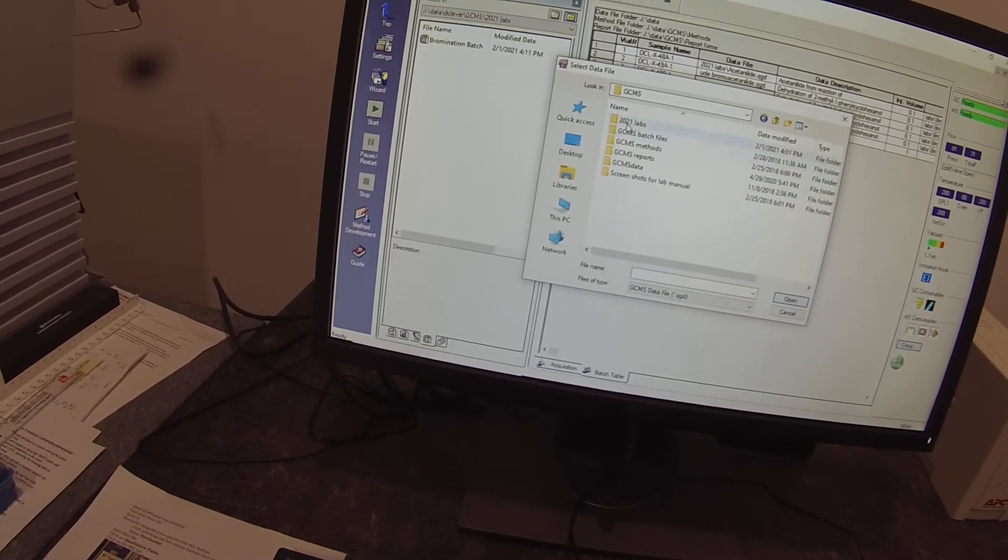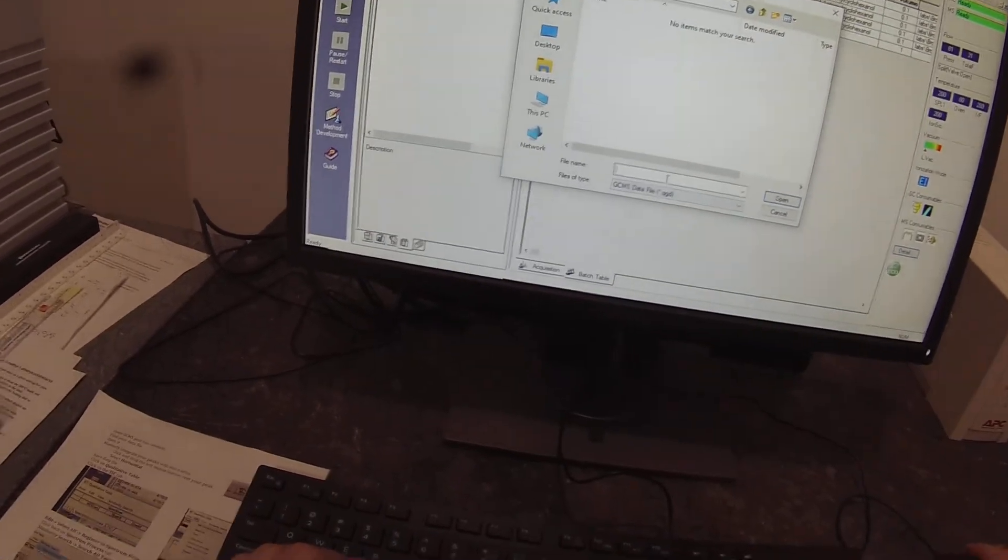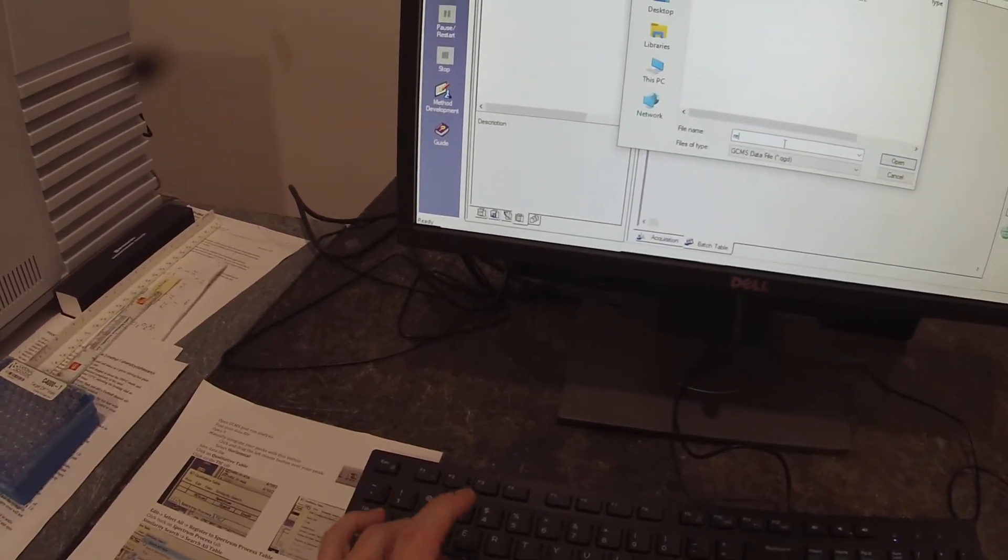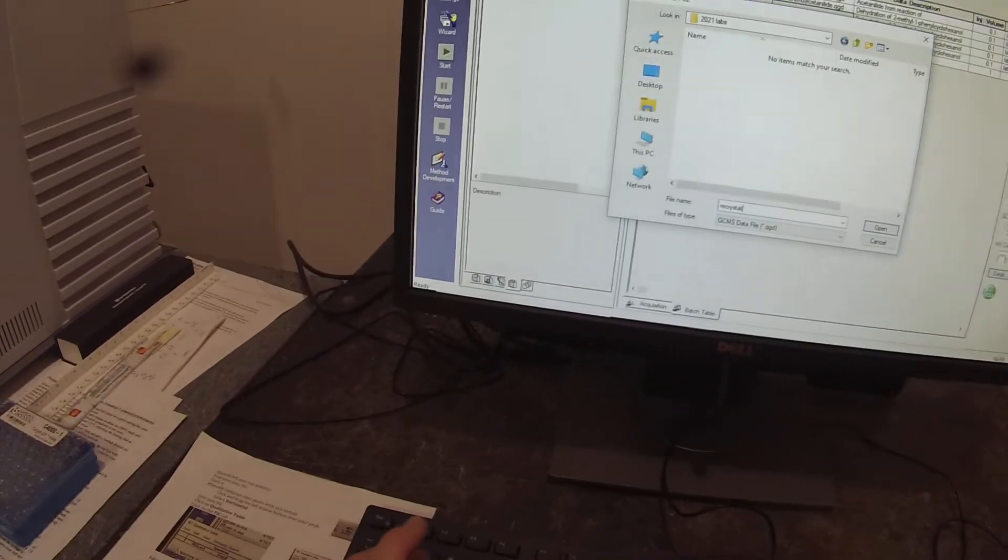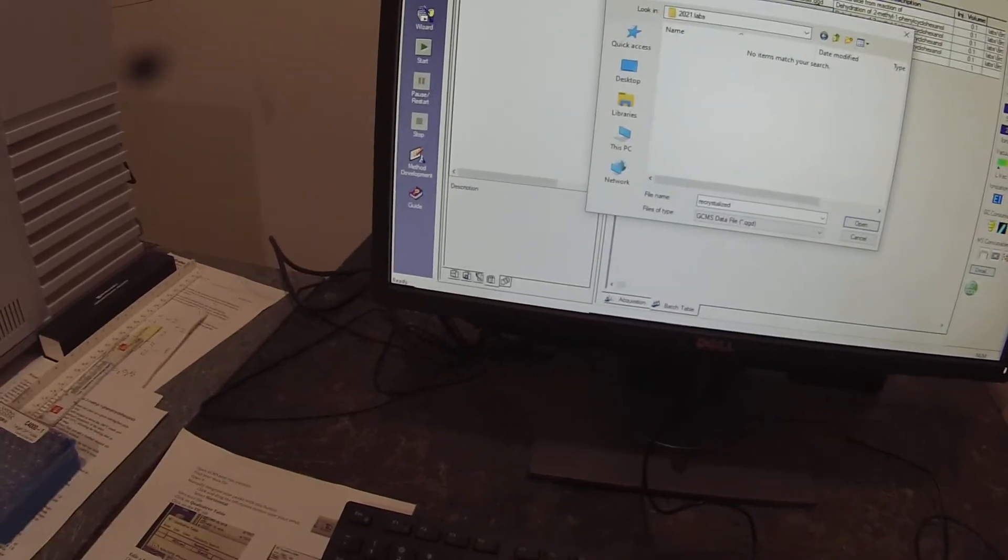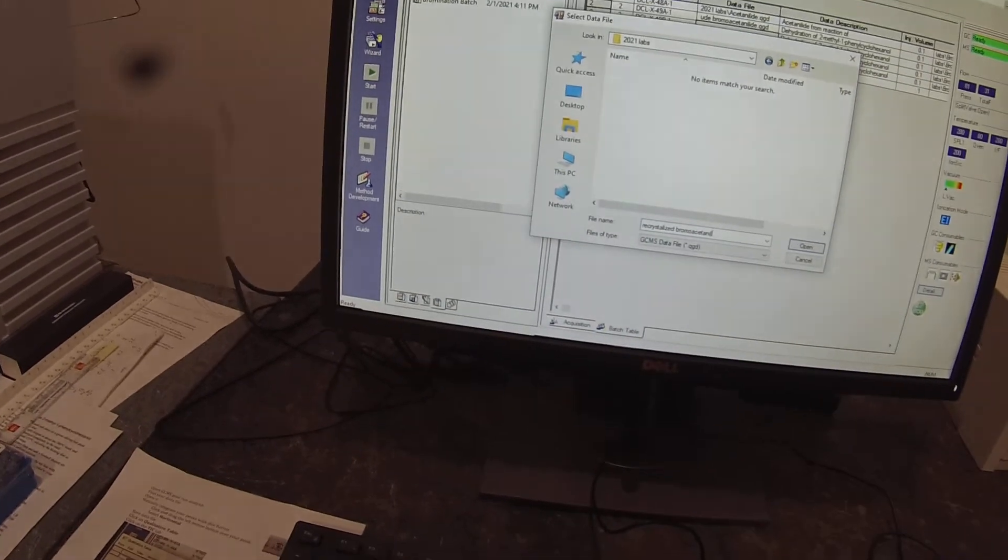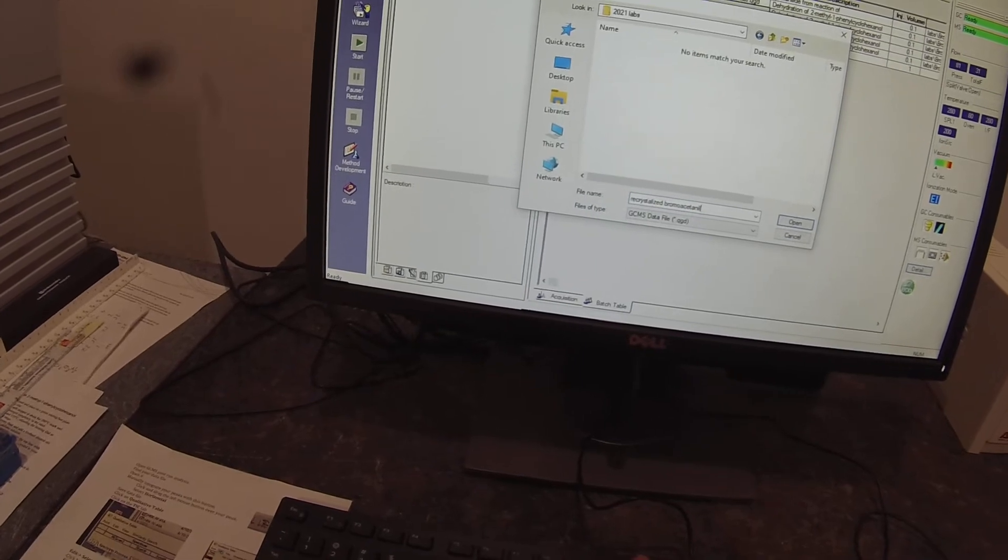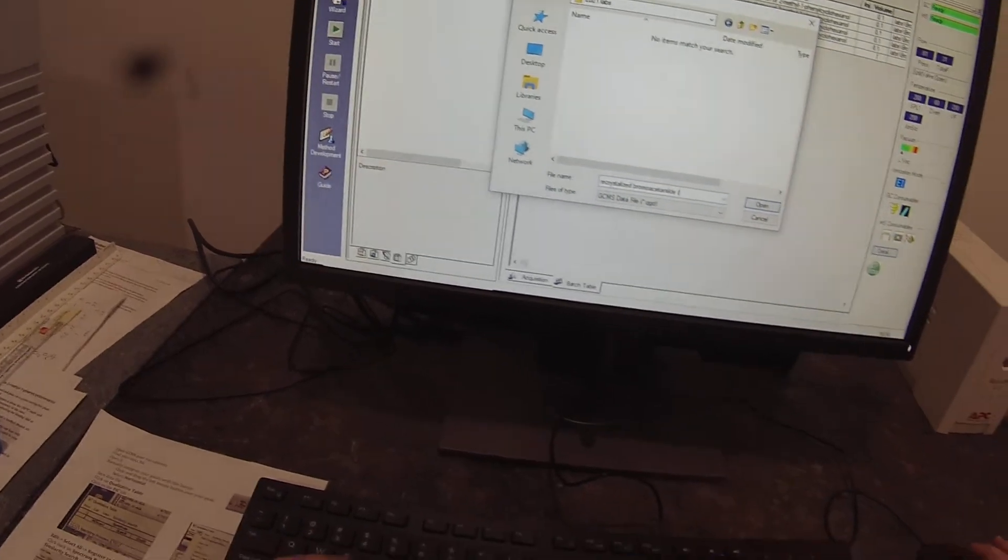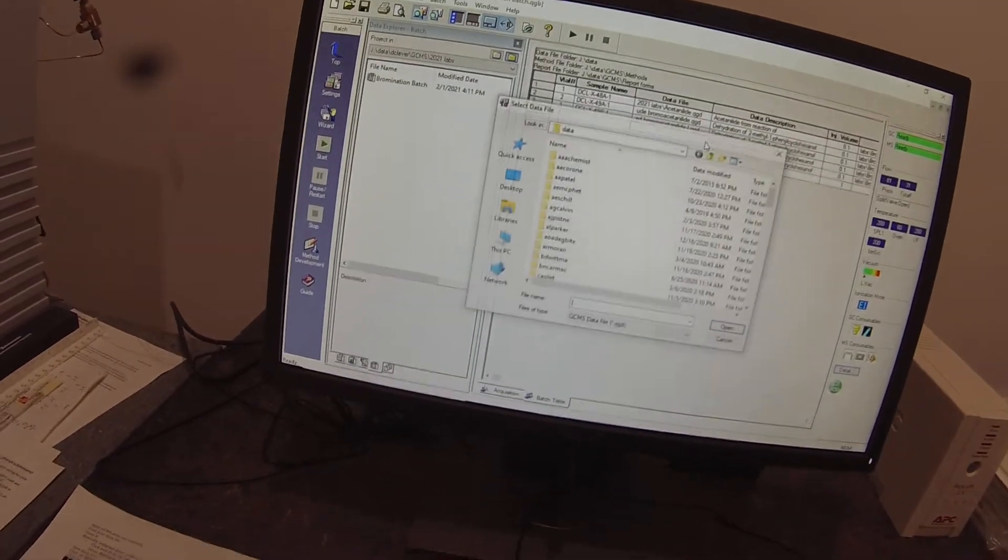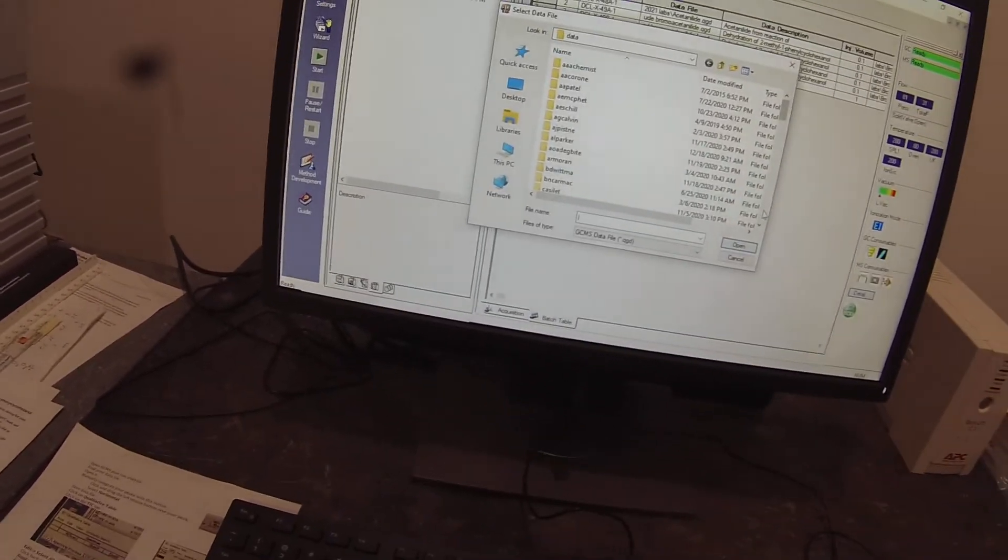And then we have 49B. And it's set to point somewhere that's not where I'm going, which is why I have to keep clicking. So this is recrystallized. And that's batch one.